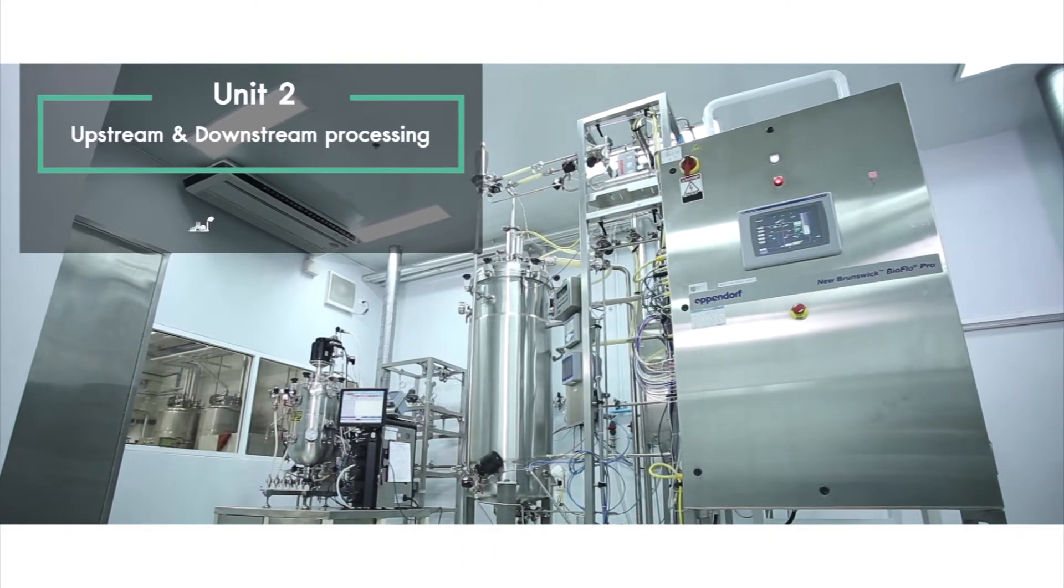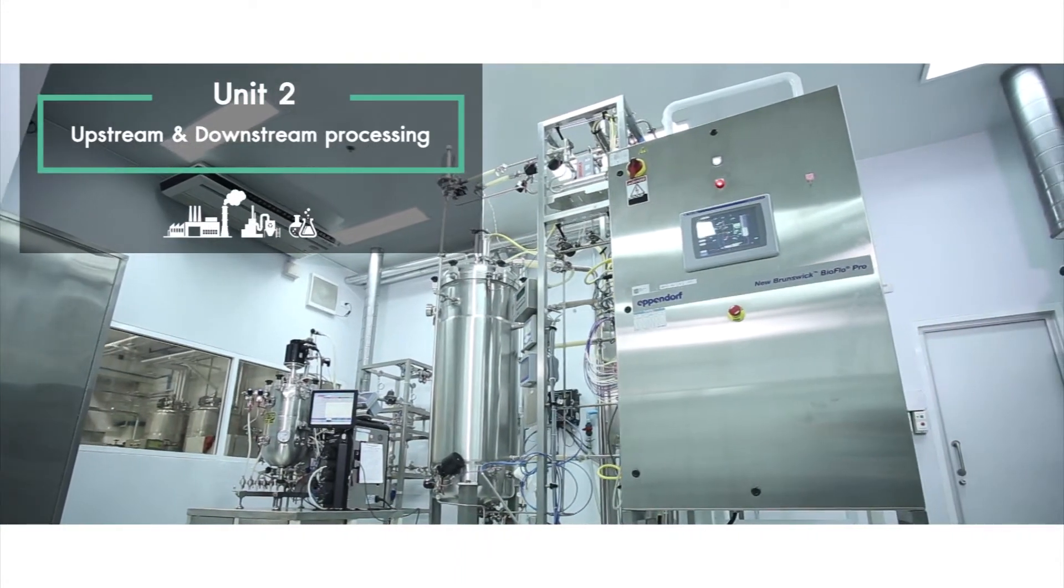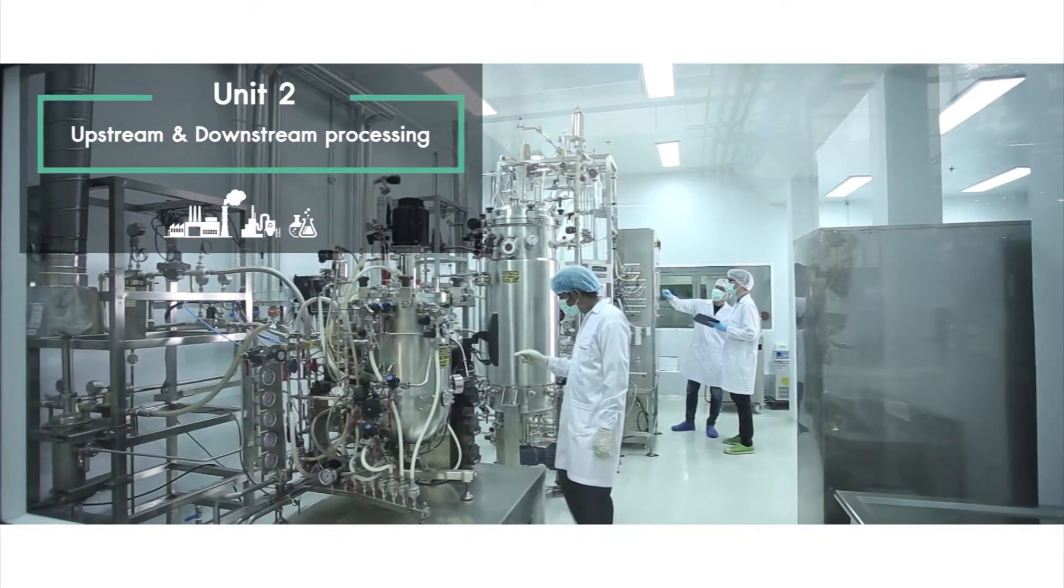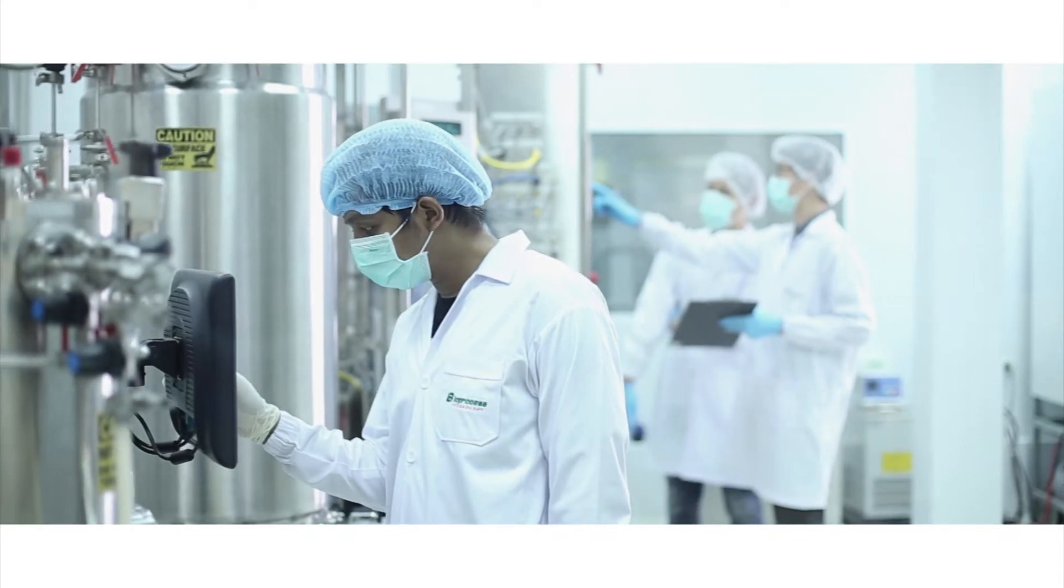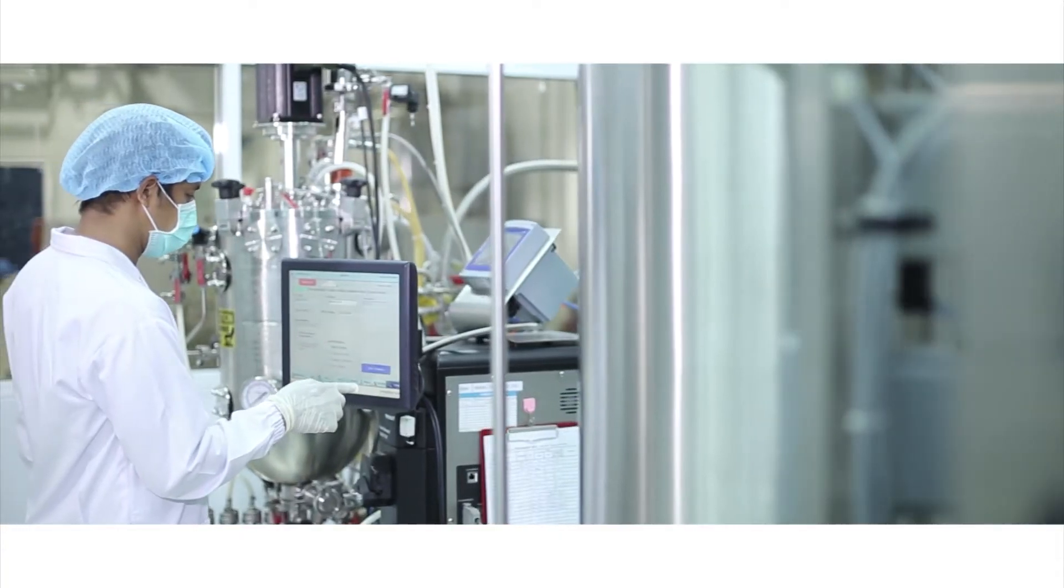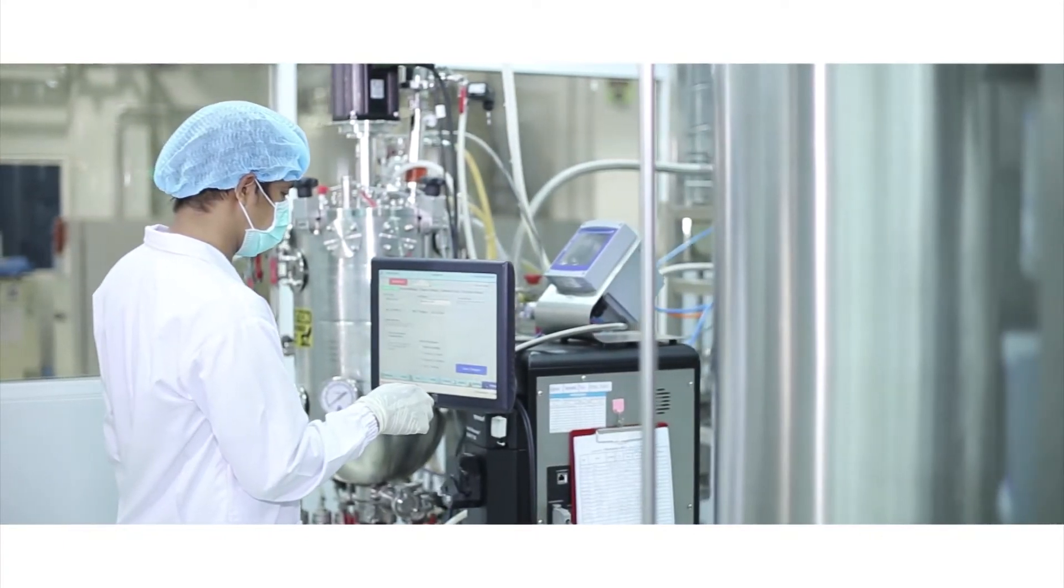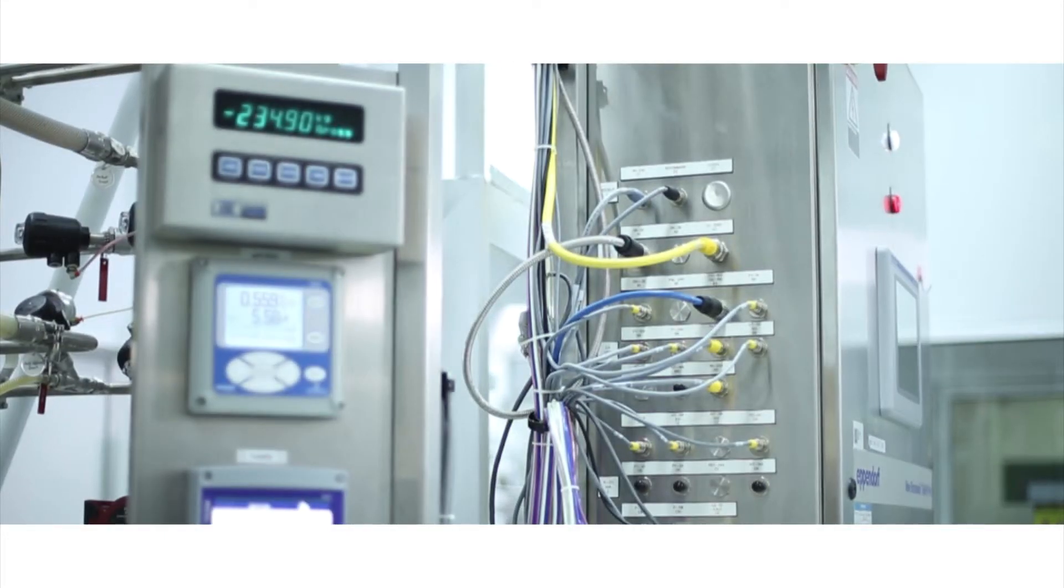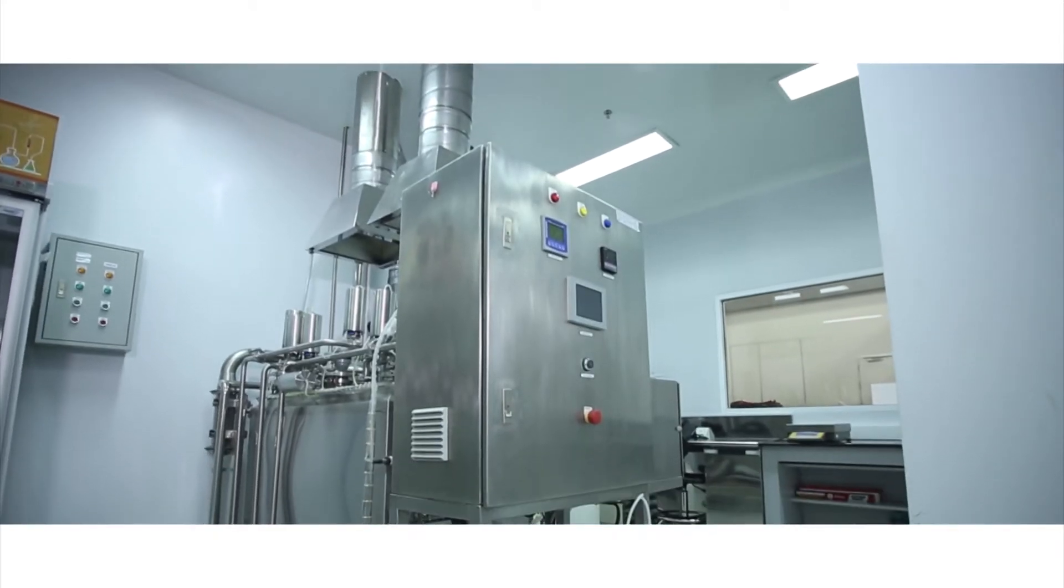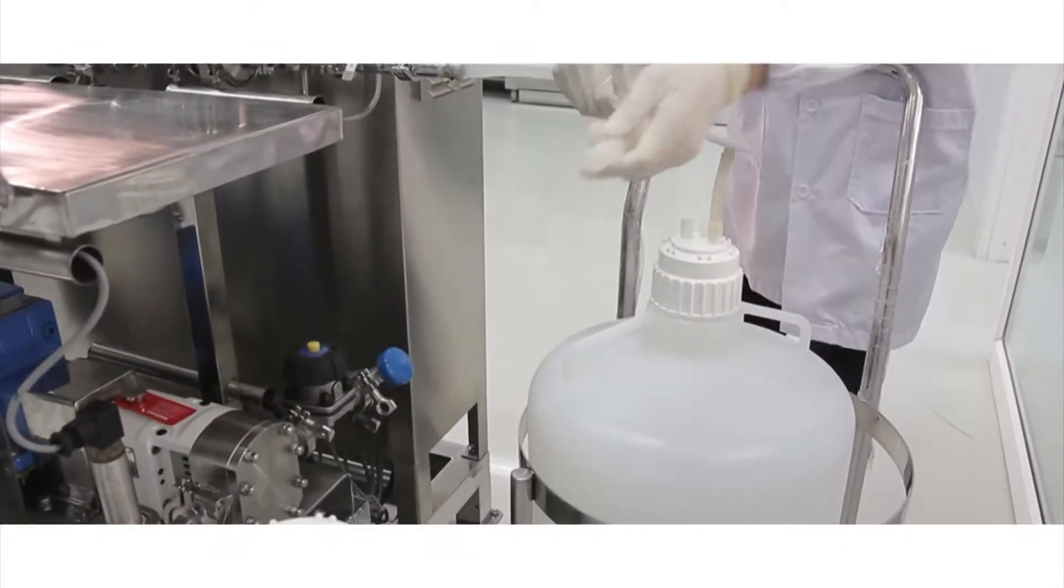Unit 2: Upstream and Downstream Processing. This scale-up unit was designed to comply with the guideline of Good Industrial Large-Scale Practice, or GILSP, for operation of genetically modified microorganisms, GMO, under LS1 containment by submerged fermentation and downstream processing technologies.